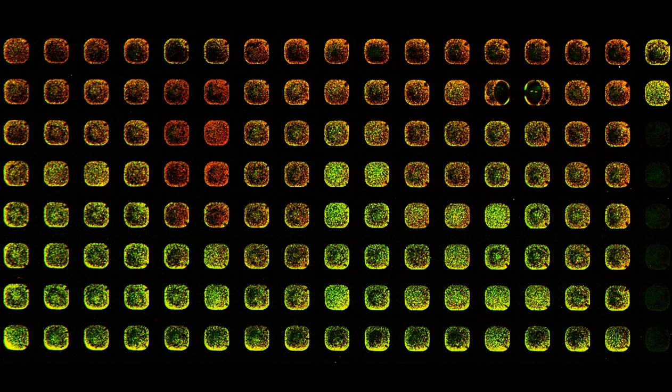And what you can see here, we used a black well plate, where only the bottom was transparent. I really can recommend to use these black plates, so you can reduce light scattering.